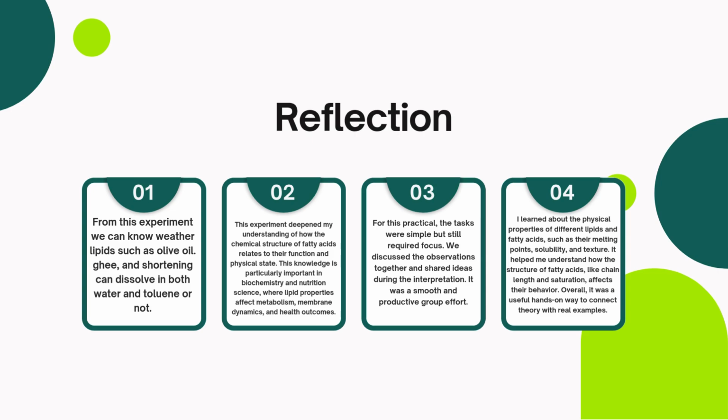Lastly, I learned about the physical properties of different lipids and fatty acids, such as their melting point, solubility, and texture. It helped me understand how the structure of fatty acid, like chain length and saturation, affects their behavior. Overall, it was a useful hands-on way to connect theory with real examples.